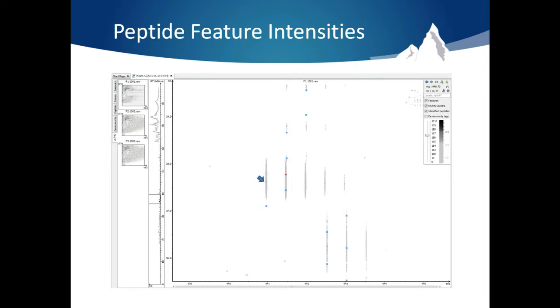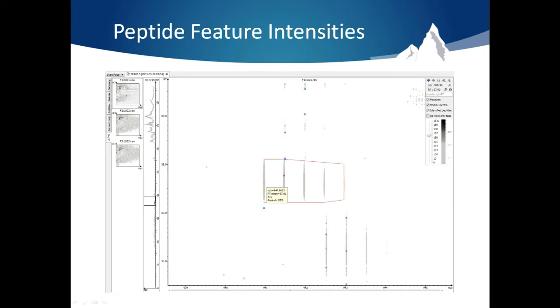Peptide features that are detected will be marked with a red circle. Scroll over the circle and a box will appear showing the detected range in which the peptide feature occurred. The area under the curve of the peptide feature will be displayed in the pop-up. This is the area we display in the peptide table.